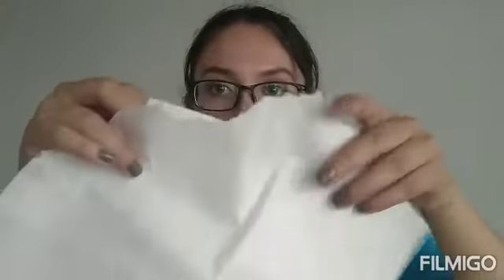Another way to check the quality of the mask is to check the melt-blown cloth. Here I have 3 samples of melt-blown cloth. The melt-blown cloth is the main part of the mask. Two of these are 25 grams and one is 50 grams, as you can see. So what's the difference between the 25 grams? One of them is more elastic than the other.